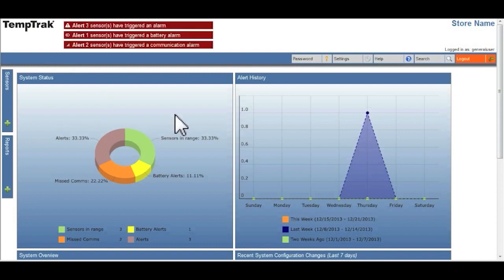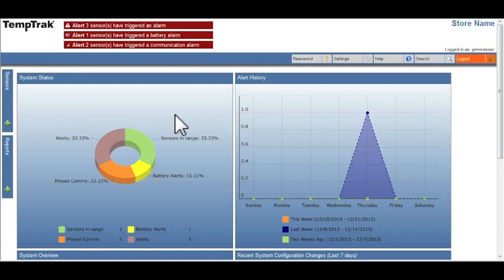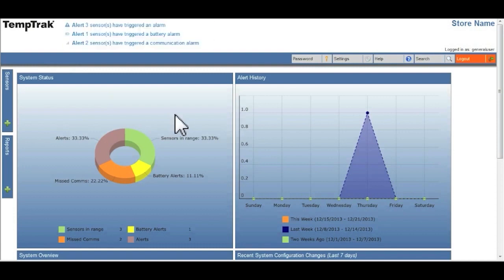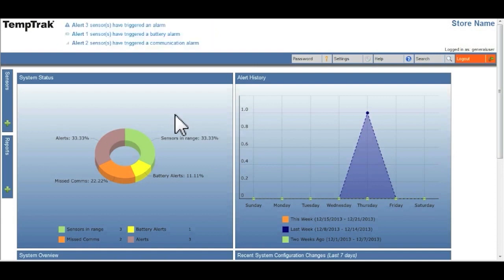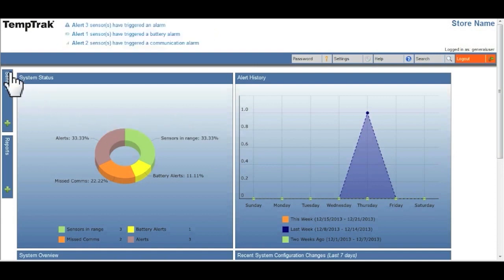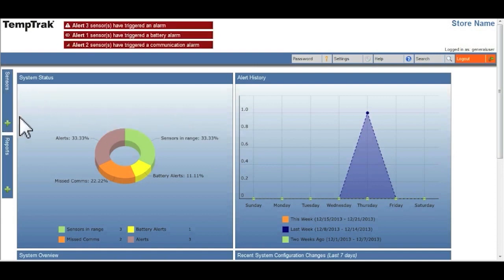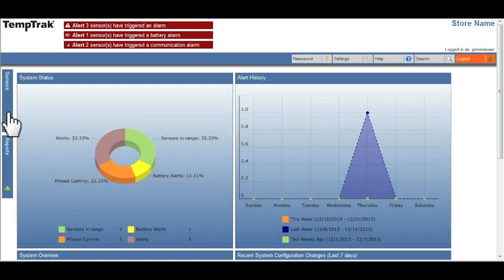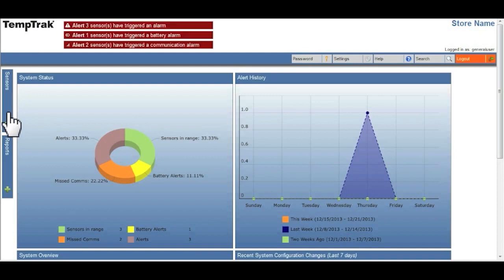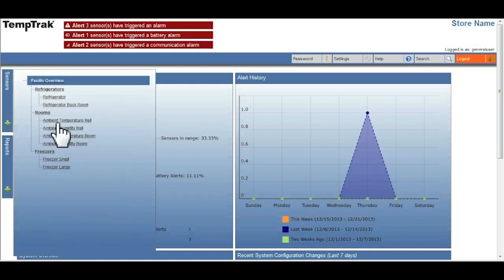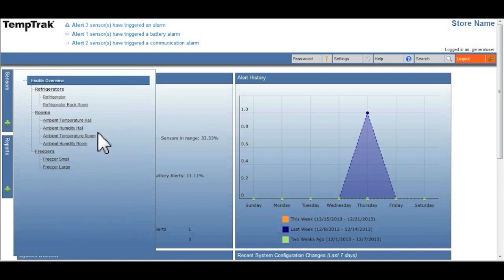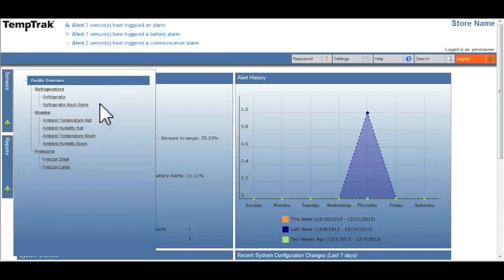the simplest and quickest way to access sensor information is using the tab on the left hand side of the screen. When you click on the tab, it opens up a listing of all the sensors that are available in your view.